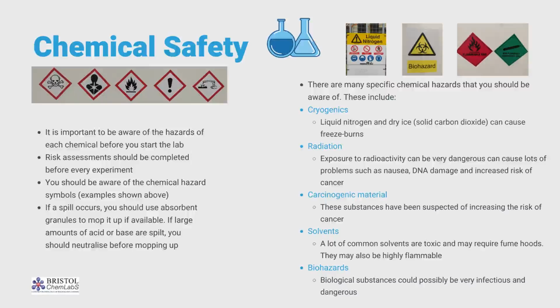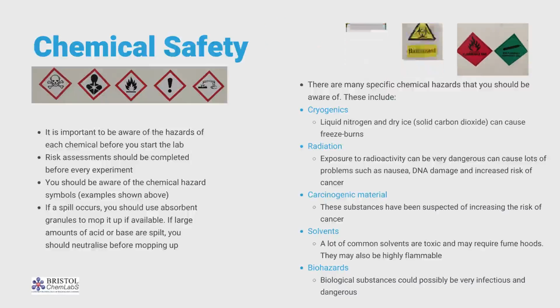Specific chemical hazards include cryogens like liquid nitrogen and dry ice, which can cause freeze burns, radioactive material, carcinogens, common solvents as they can be toxic and flammable, and biohazards.